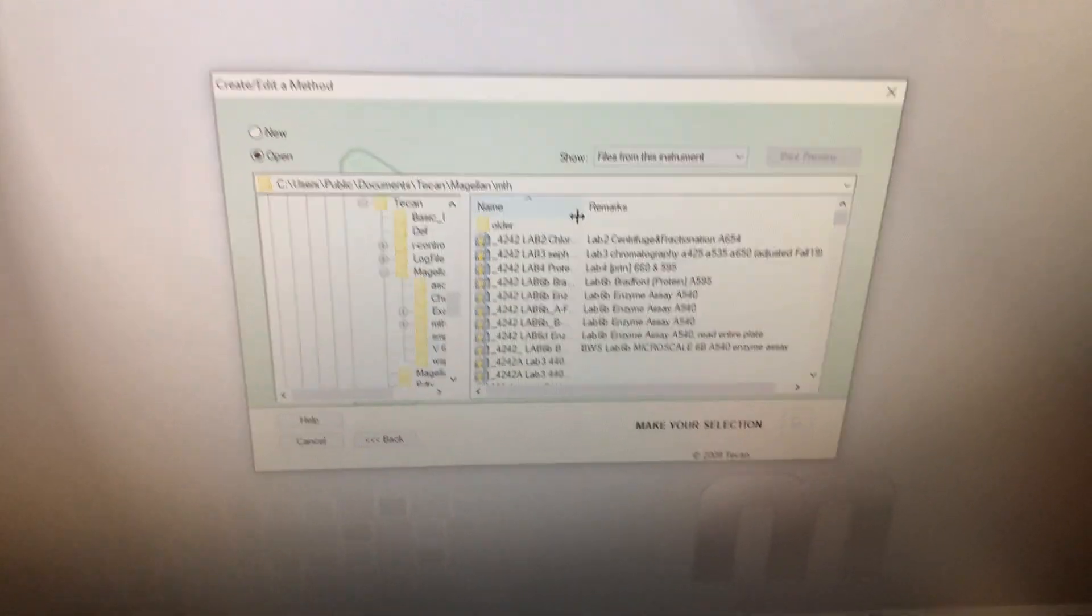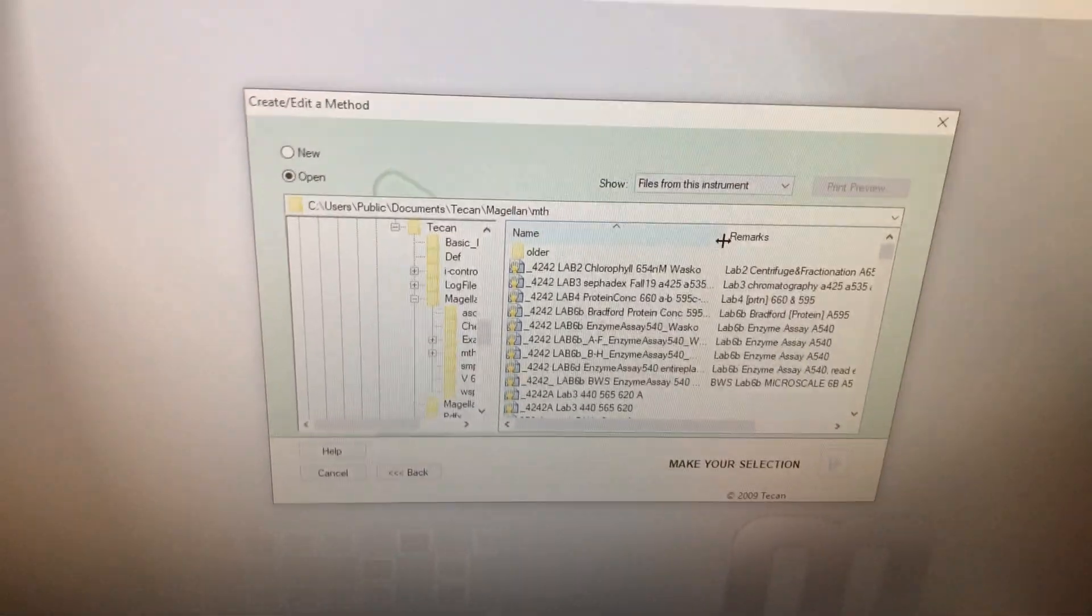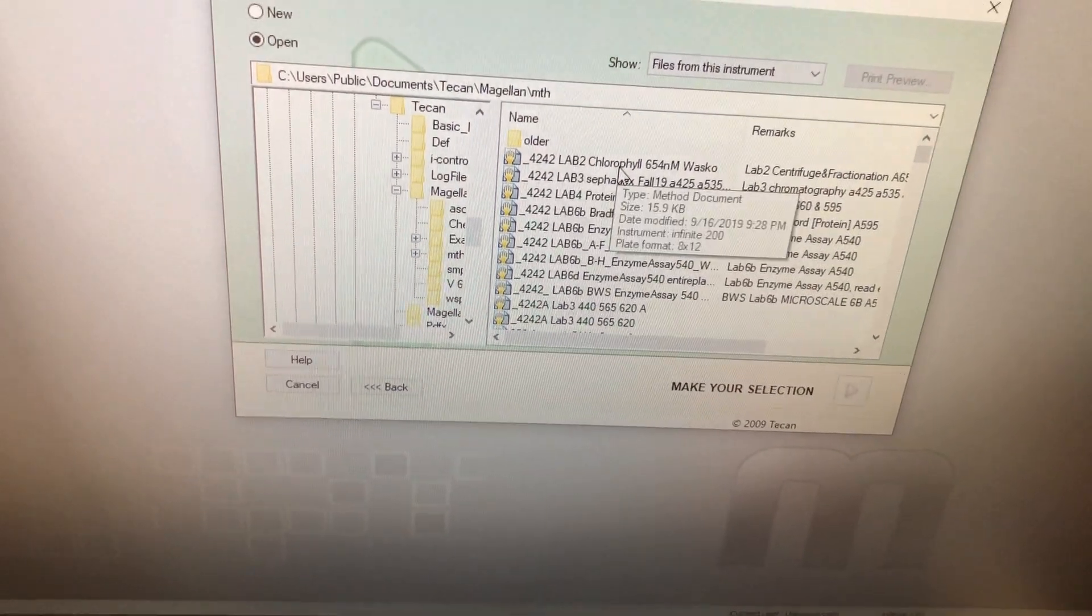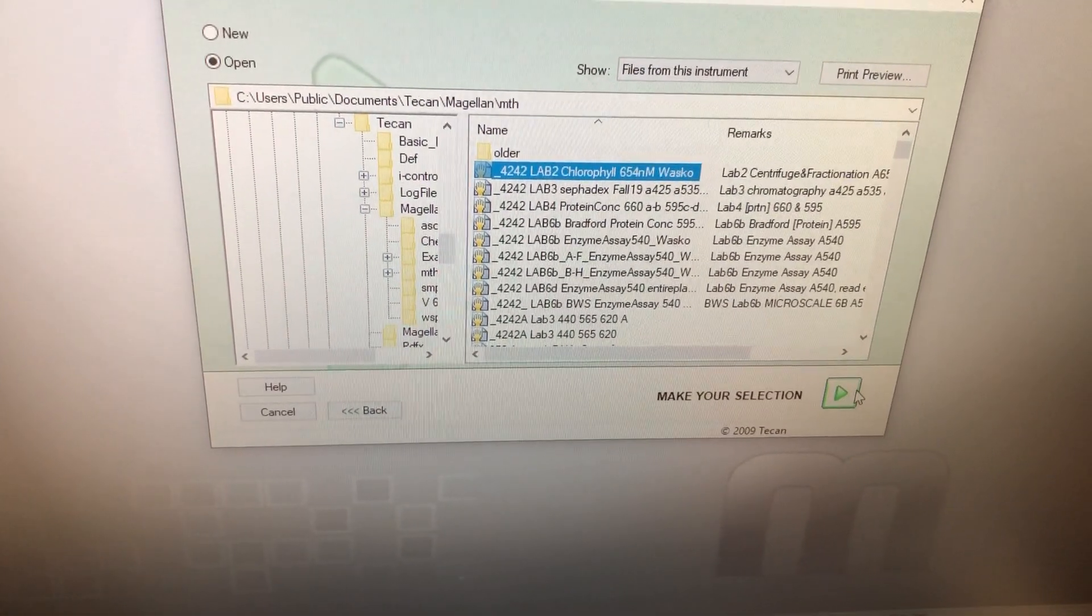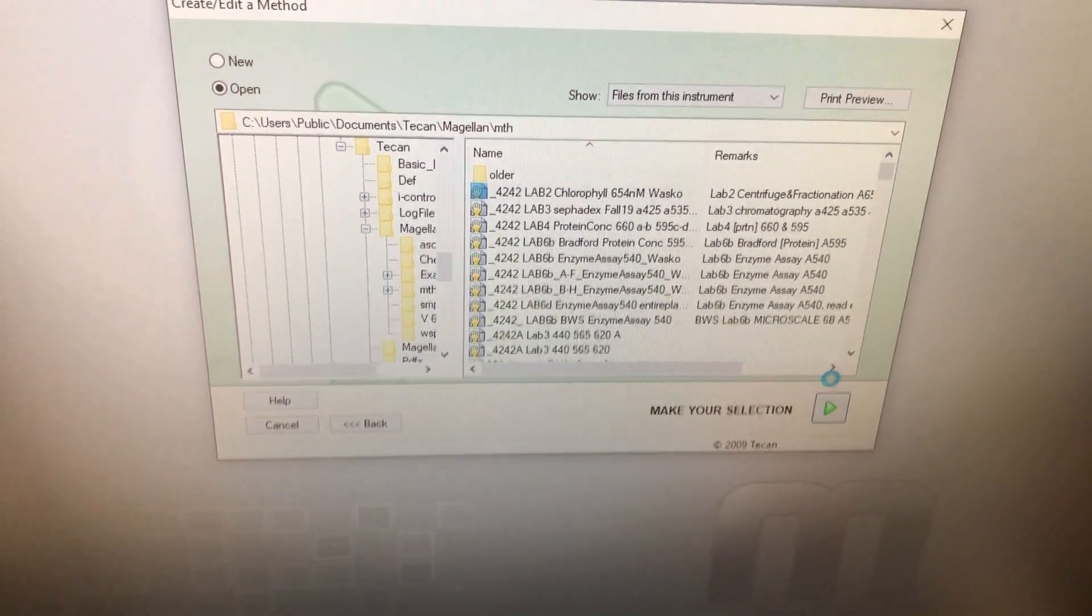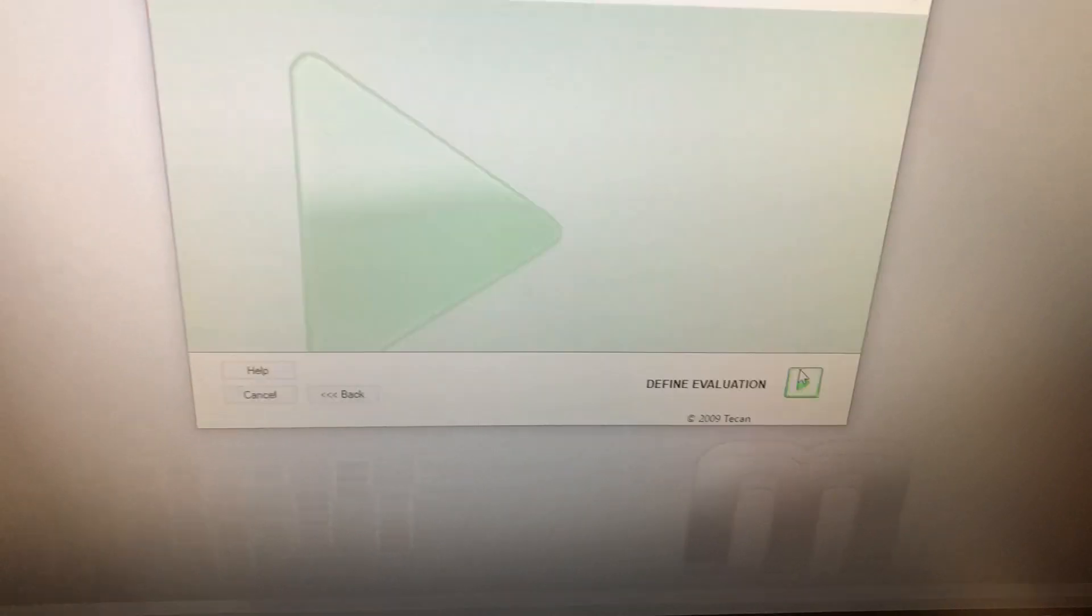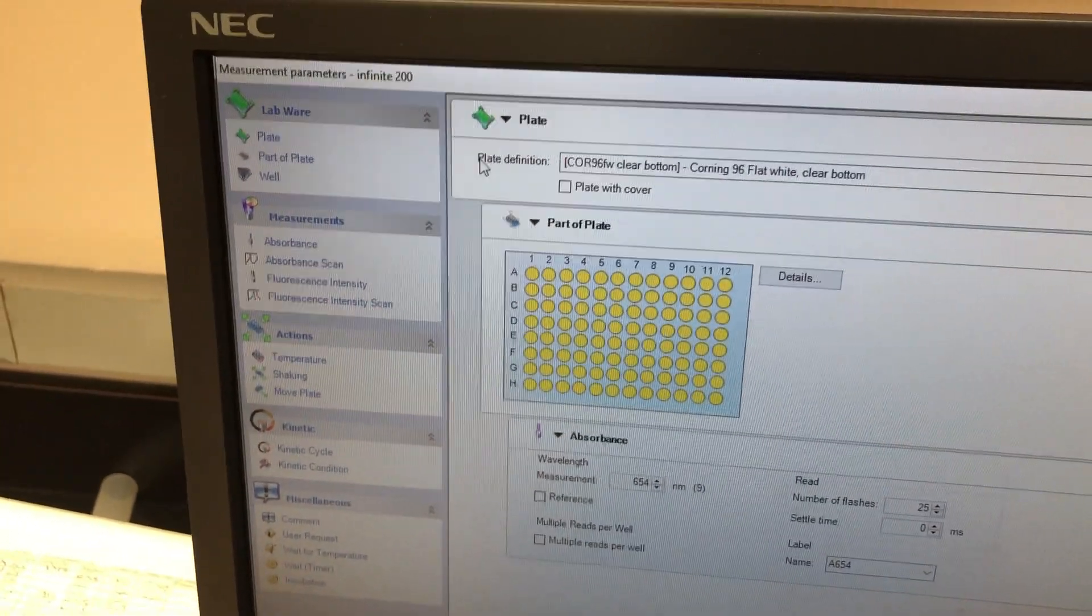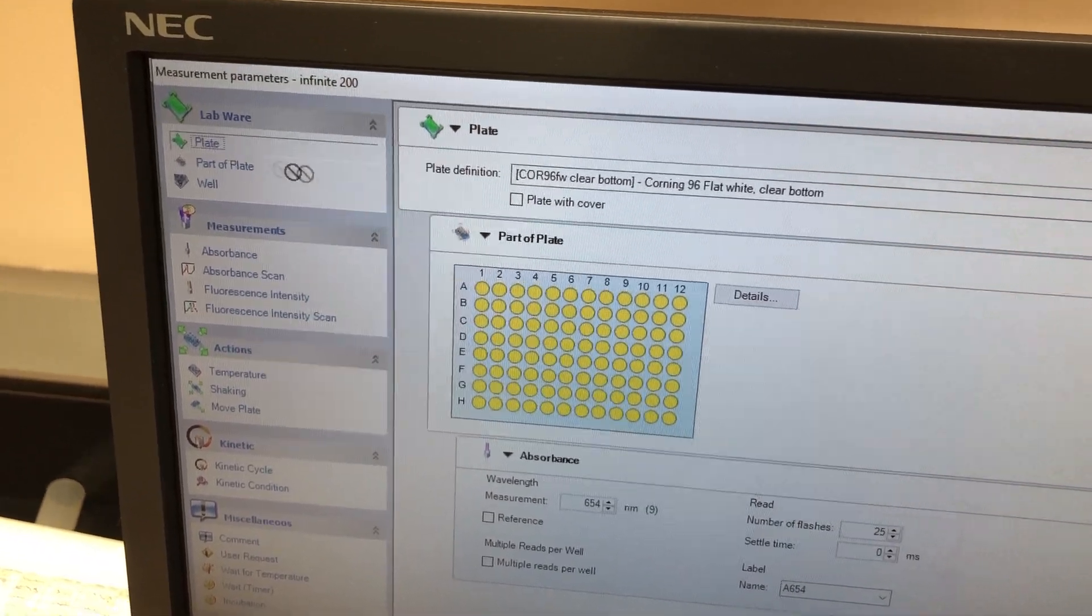You can see it kind of defaults to giving us some existing options. So for the biochemistry teaching laboratory that we commonly use, we already have some preset ones here. So today I'm going to open this Lab 2 protocol, just to show you how this works. Just going to click the little green arrow. It's going to load. And now we've got a couple things going on here. It's not really hard to set this up for yourself. This is just a drag and drop software.